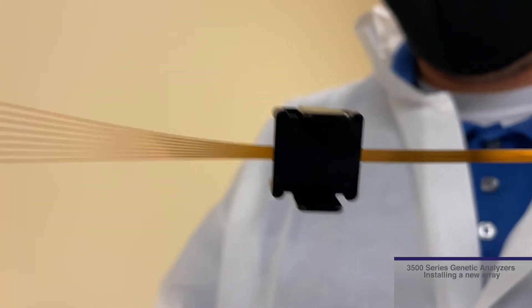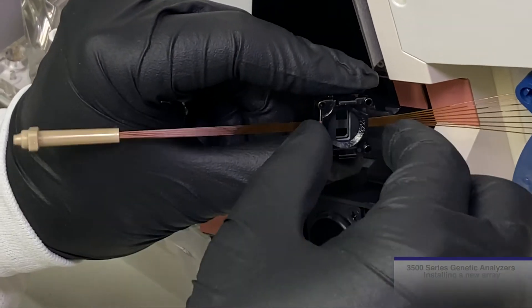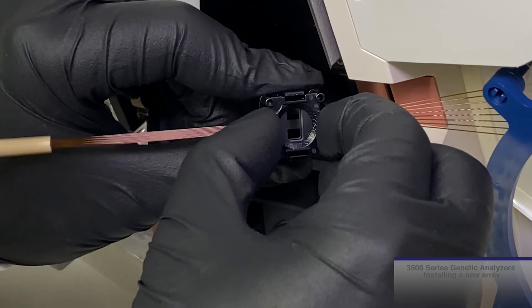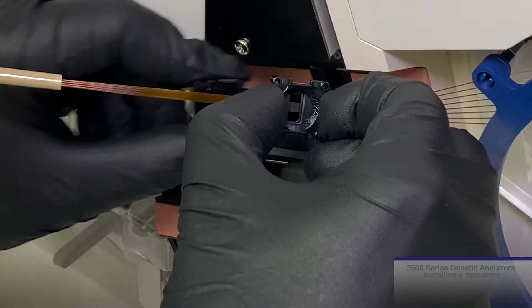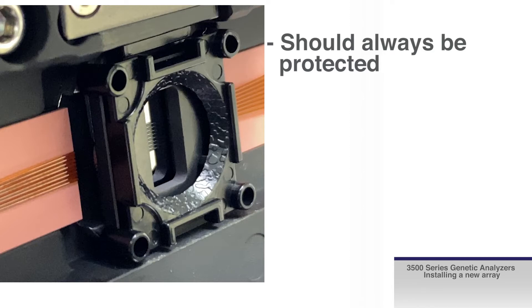Next, the detection cell. Be careful when removing the detection cell window cover not to touch the detection cell window. Remove the cover by pressing on both sides of the clip and gently pulling the clip away. The detection cell can be held on the edges, being careful not to touch the uncovered surface. The detection cell window should always be protected.